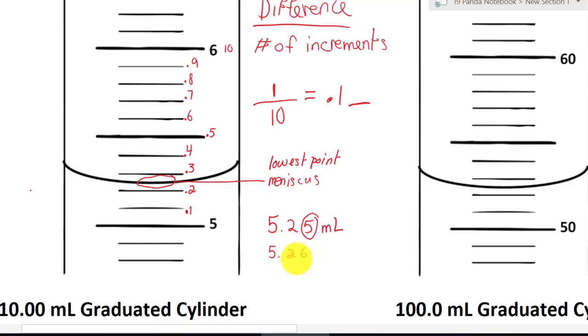So it could be five point two six, five point two seven. All these numbers are estimated. So your last digit will always be estimated.